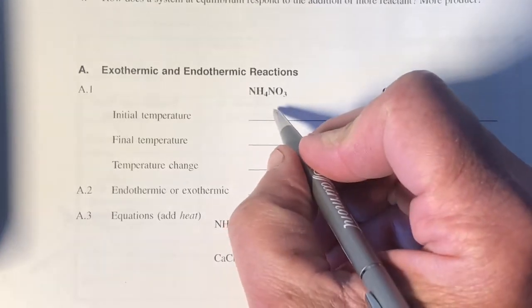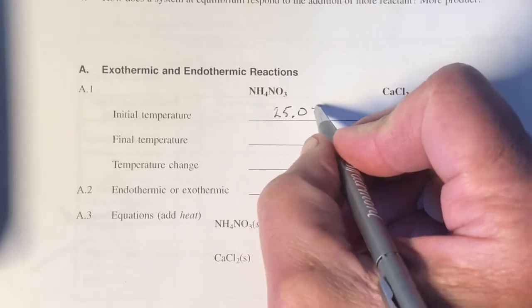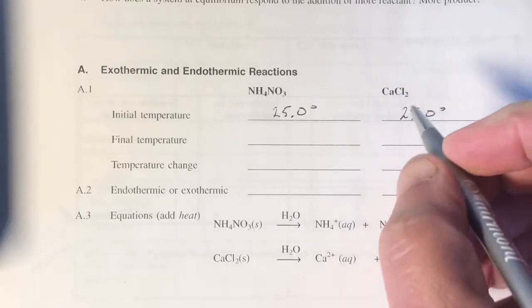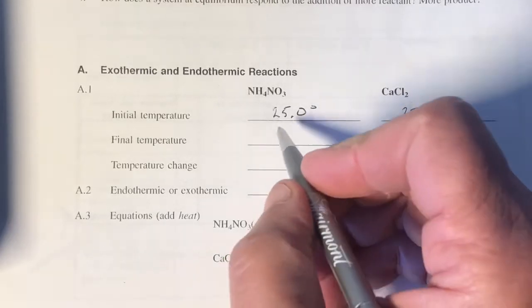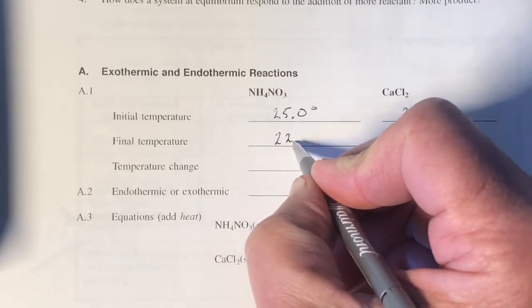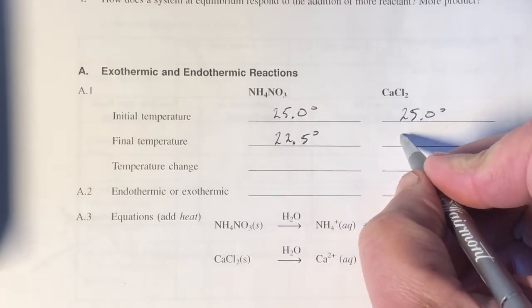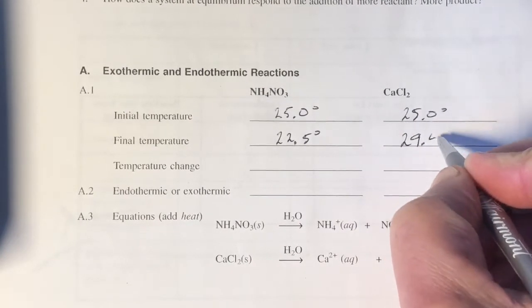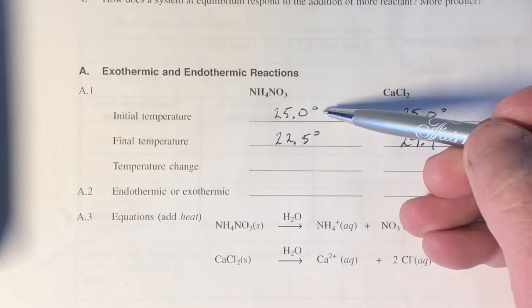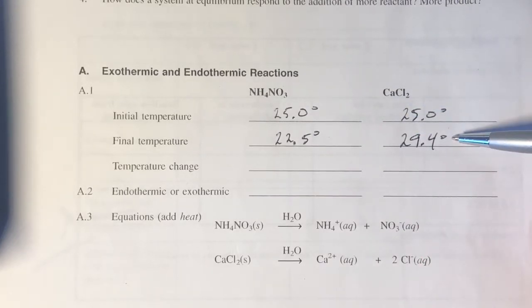So typically what happens is we've got a room temperature start. So if we say maybe we're 25 degrees Celsius, and we monitor with a thermometer, but your hand is almost a better tool for this. With the ammonium nitrate, we typically drop a couple of degrees, 22 or so. Say it went to 22.5 degrees, and the calcium chloride typically heats up. All right, so we had the ammonium nitrate cool off, again, cold to the touch. The calcium chloride, it's a little warmer to the touch.